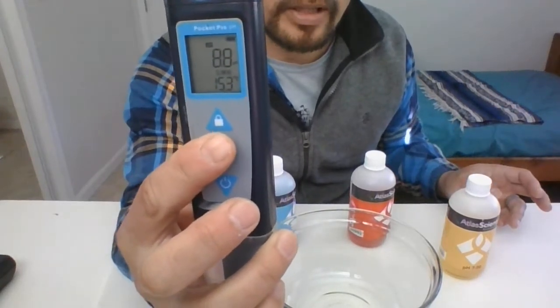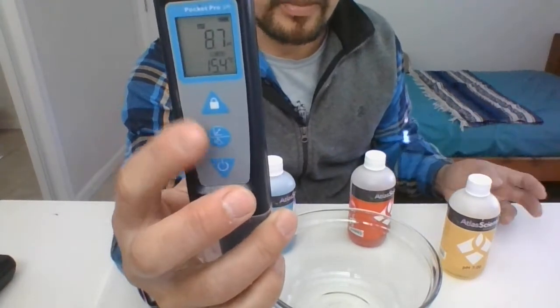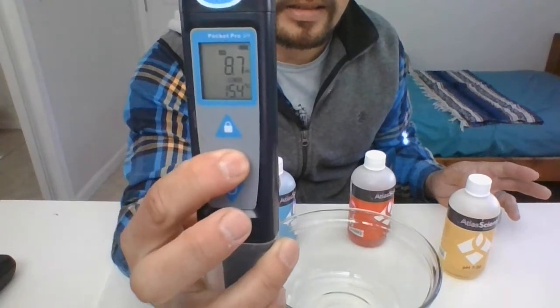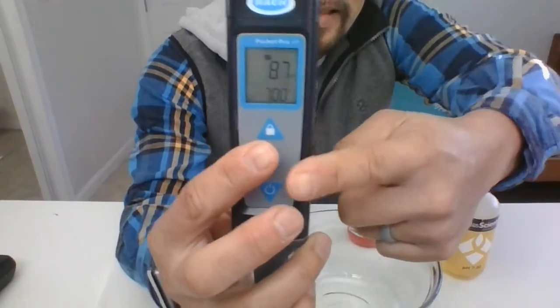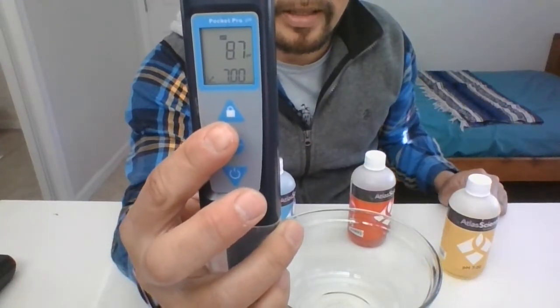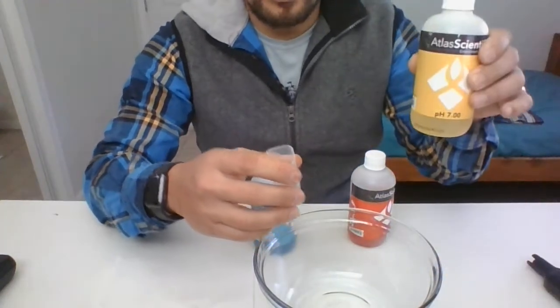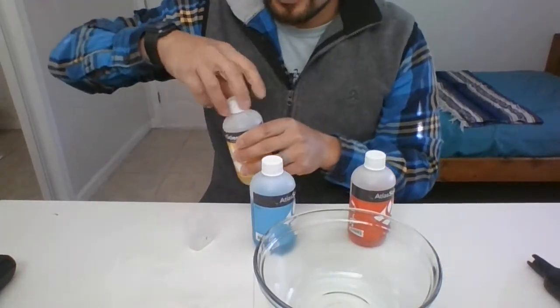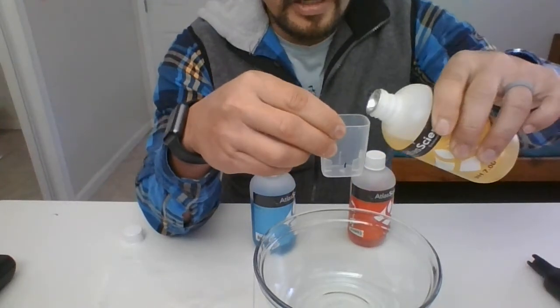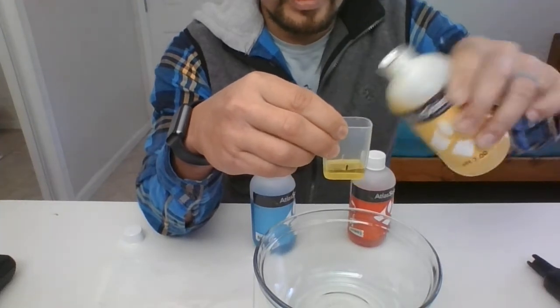We're ready to go ahead and start calibrating. Once it says 'N' and you're ready to calibrate, hit that circle button one more time for just about a second. At the bottom you'll see it says seven — that's when we're ready to start calibrating. Go ahead and take the cap off and get your pH 7 buffer, the yellow one.